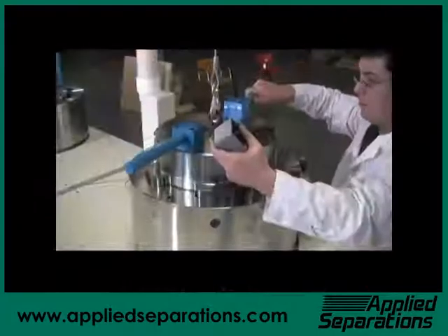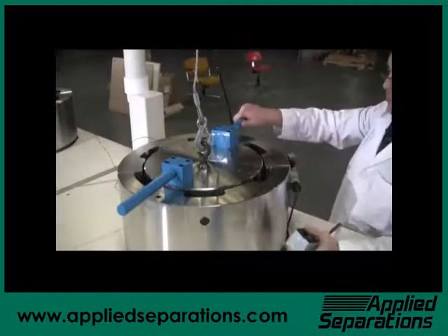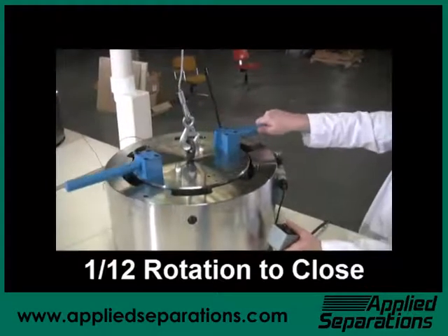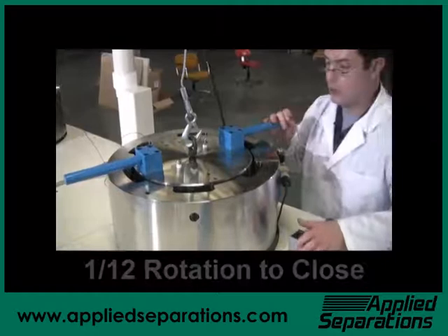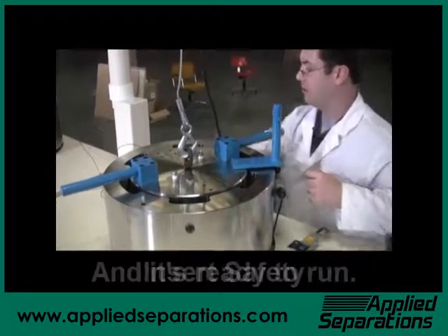Simply position the lid over the vessel and lower it until the lid is fully seated. To close the vessel, simply turn it one twelfth turn. Insert the safety device and your vessel is ready to use.